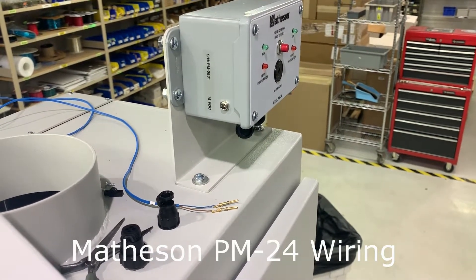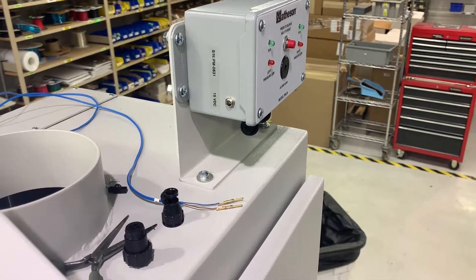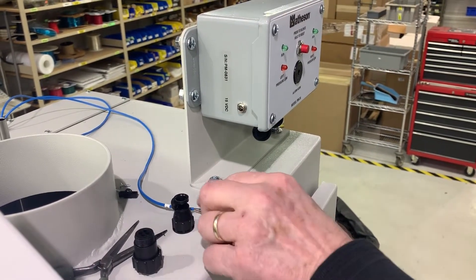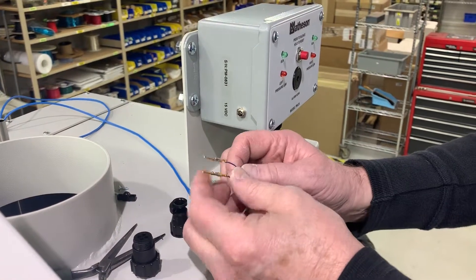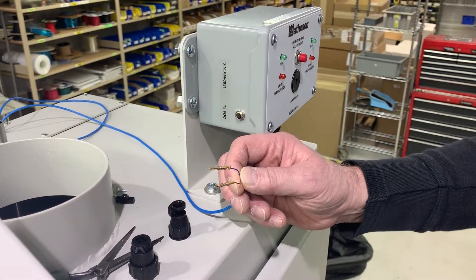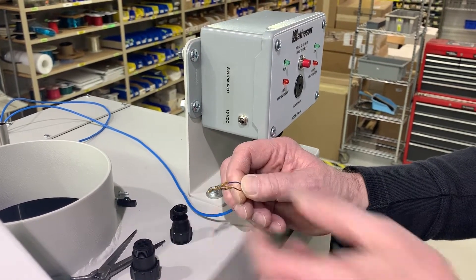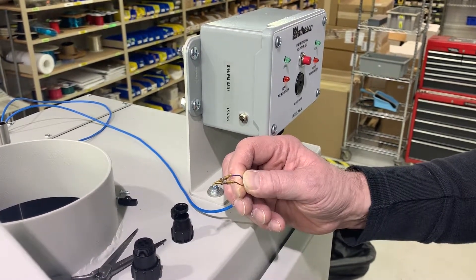Today we are showing how to connect the IPS to a Matheson PM24. First thing we do is crimp the connector pins to the wires. I've already done this, and then I give a quick tug to make sure they're crimped properly.